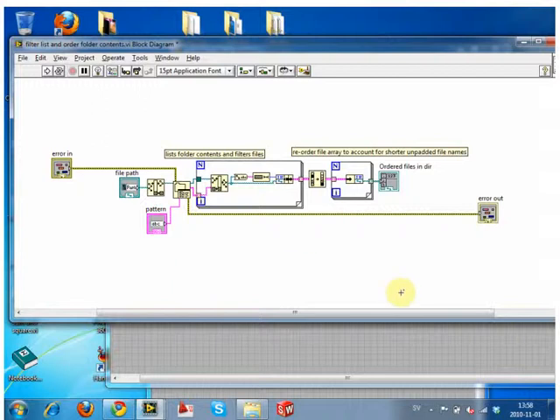You can use this type of VI all over the place, and it's very universal, meaning even if they're in the right order, you can use it anyway, because it doesn't destroy any order. It just relooks at it. If, let's say, you've zero padded with the 6-0 thing, then they all have the same file length. So they're all the same number, they're all the same length, so they all go into one bucket, and then it's ordering them based on the file name anyway. It's kind of assigning them a number first, and then ordering them all basically into the same bracket, and then ordering within that bracket.